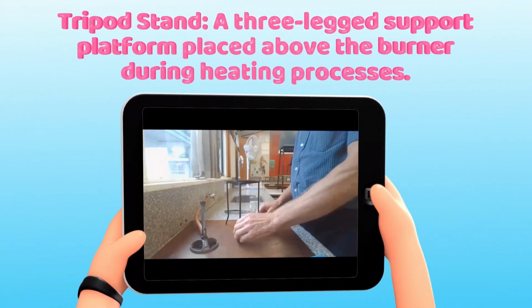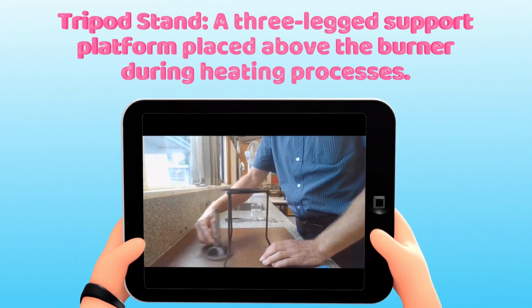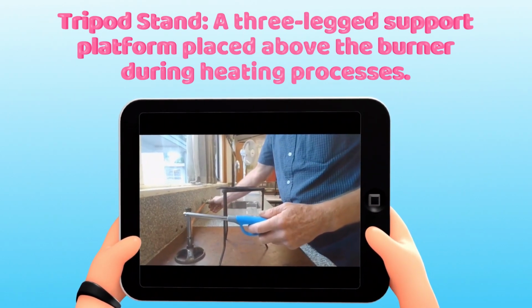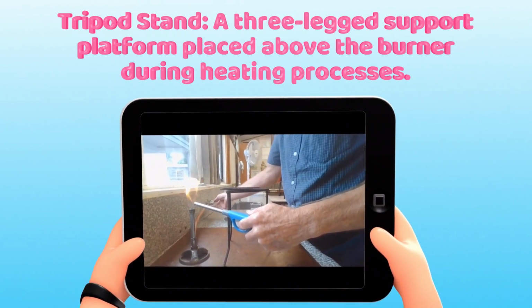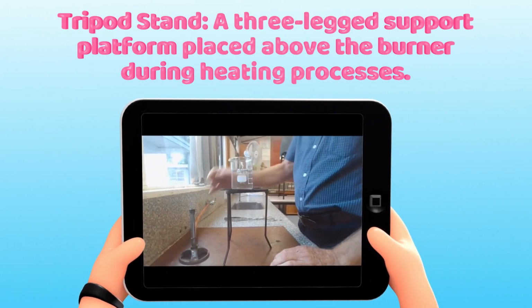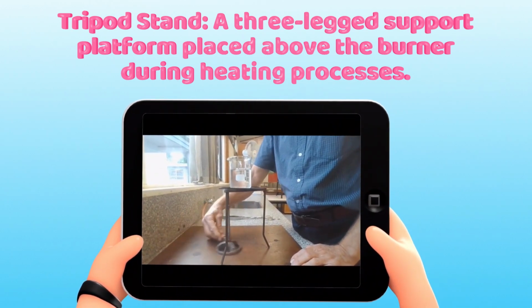The other type of apparatus commonly used in a laboratory is the tripod stand. This is a three-legged support platform placed above the burner during heating processes. We call it tri because it has three legs. So, it is usually used for supporting apparatus in the laboratory. It helps to support the apparatus during heating.